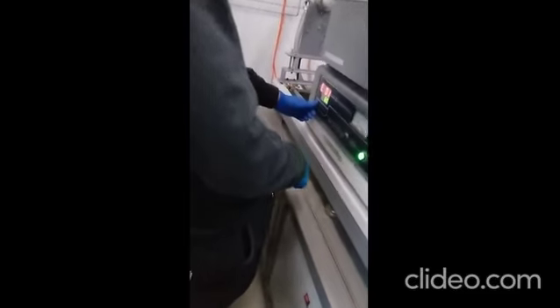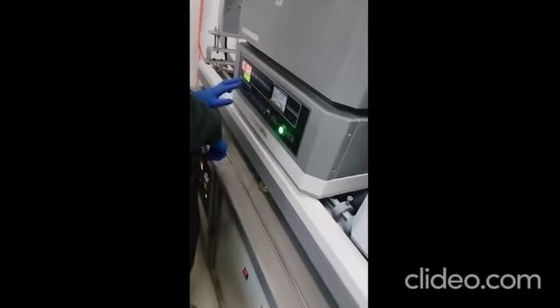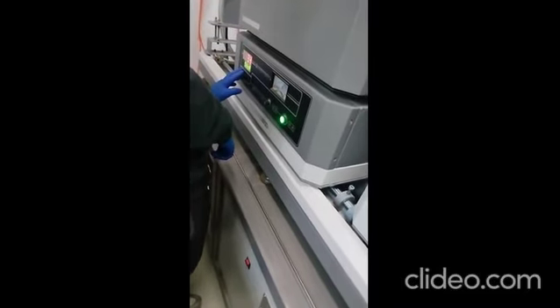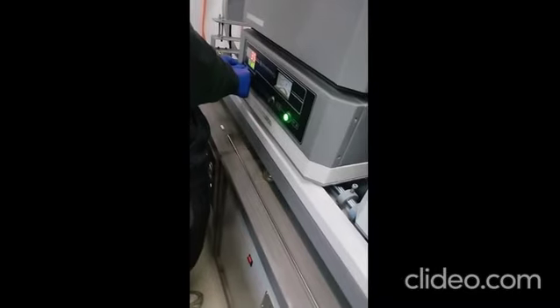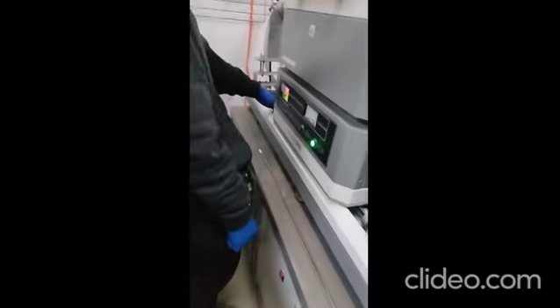So now stop argon, right? Yes. Okay. Temperature, about how much? 1100. Oh, okay. Maybe it takes 20 hours. Or just 1 hour. 1 hour and it's reached. Oh, that's quick.